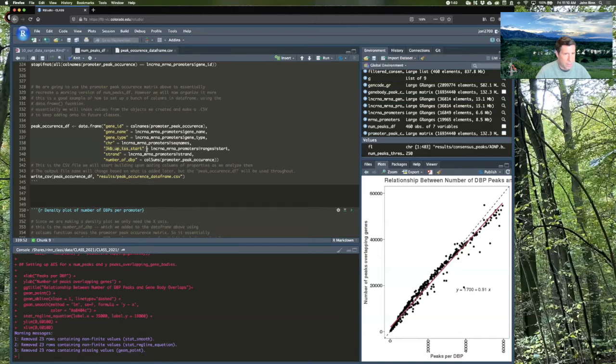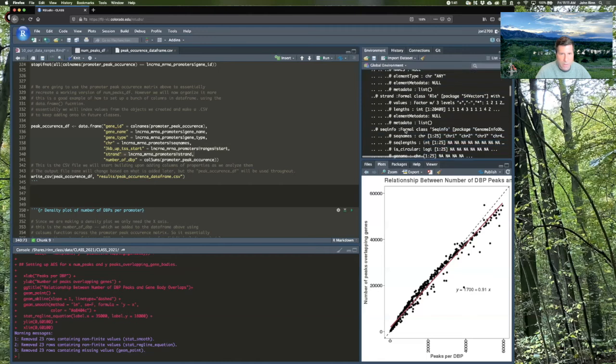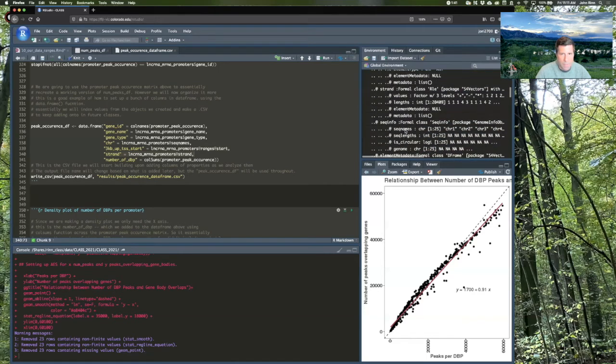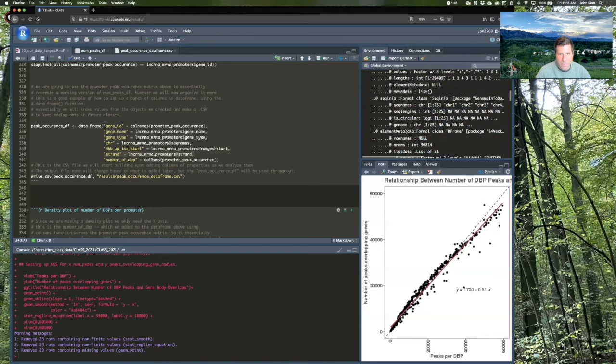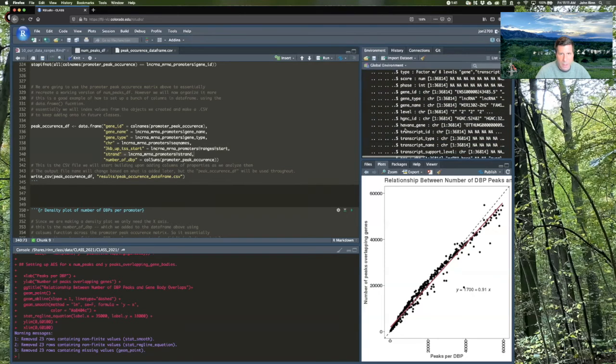We're making the promoters of these. We're going to set the coordinates of the promoters that count peaks per feature used in a version of the promoters genomic ranges function. So that's just saying where our promoters start and stop. The strand we can grab from, again, all this metadata that we have in these GRanges that we can always get from. And so we can get the start and the strand in here and other things that we can index.